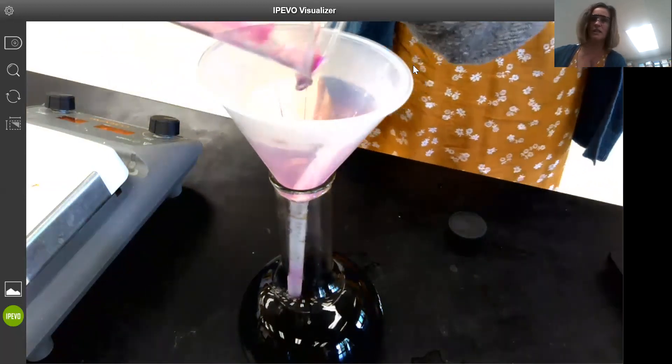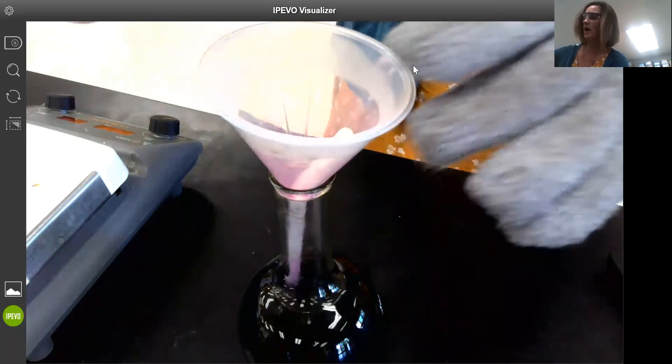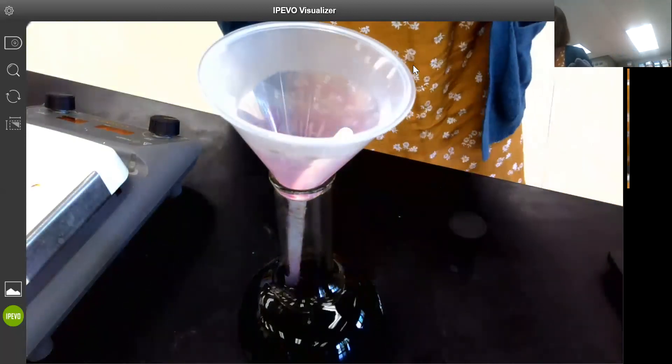That little drop right there was the magnetic stir bar just falling into the top of the funnel. We'll get that out of there.